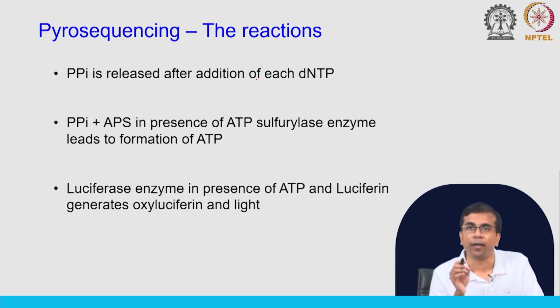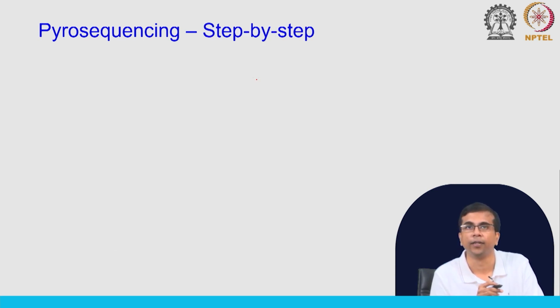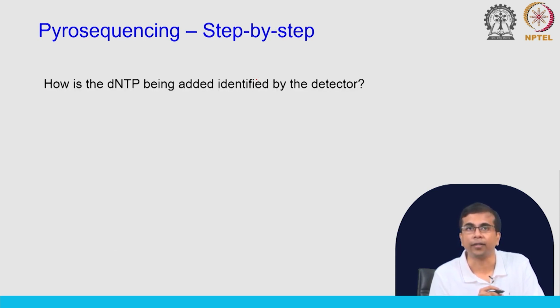Now, this is the principle, and the detection happens by the light signal that is emitted because of all these reactions that are happening inside these wells. And you have a detector that detects this light. So, step by step, let us look at this.